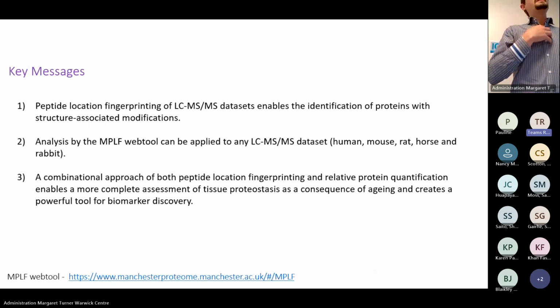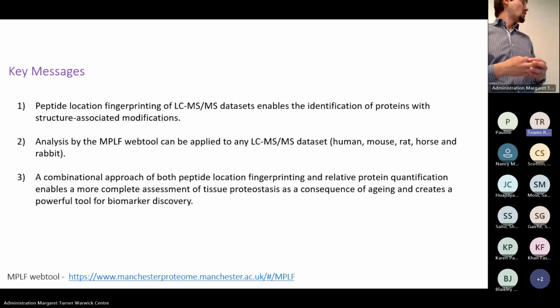And we found that a combinational approach of PLF and just normal relative standard proteomics leads to a more complete assessment of tissue proteostasis and a better understanding of what's going on in aging, but I'm guessing that it would be the same thing in a disease like fibrosis.